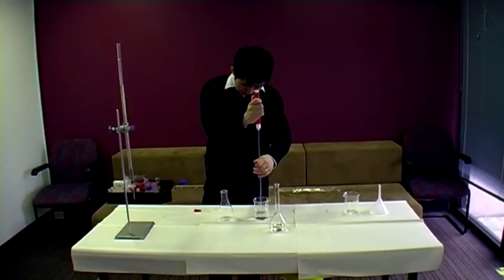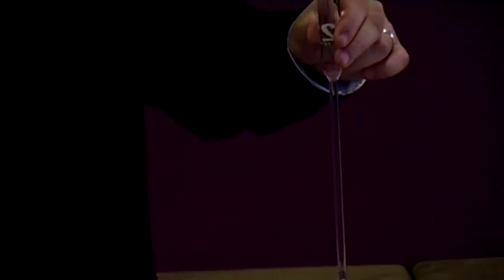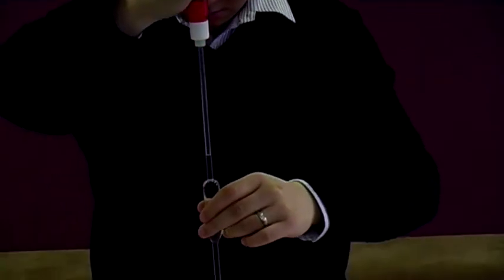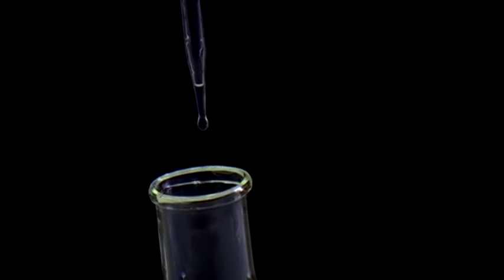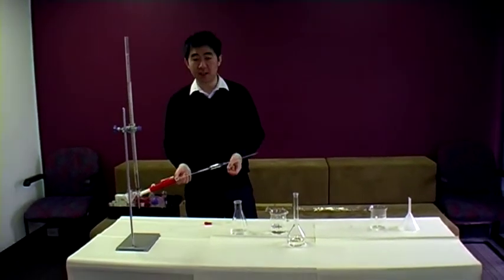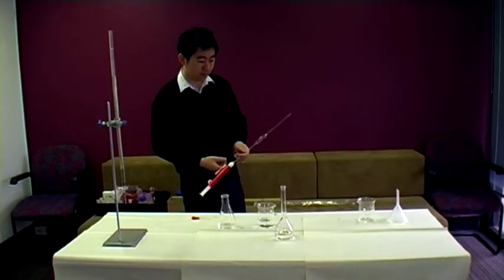Draw the solution up past the mark, then push it down until it's exactly at the mark. When releasing into the conical flask, do not force the last drop — whatever gravity alone can get into the flask goes in; anything beyond that does not belong. The reason is this is calibrated volumetric glassware. When the glass was being made, that was all taken into account. If you force the last bit of liquid in, you'd get slightly more than 20 mLs, and we don't want that.